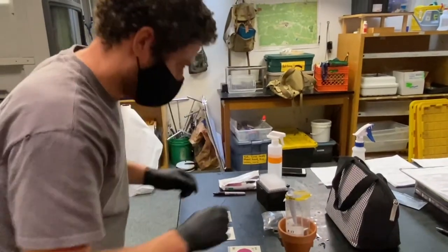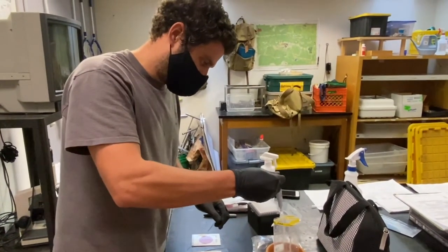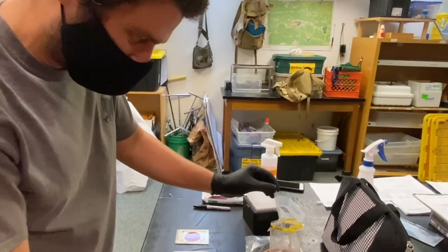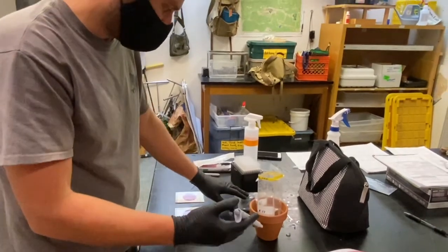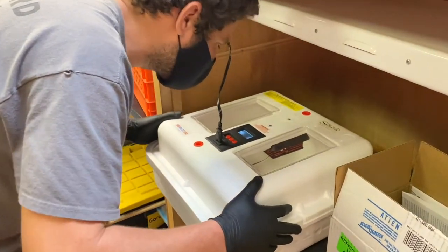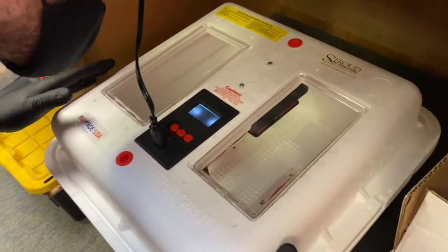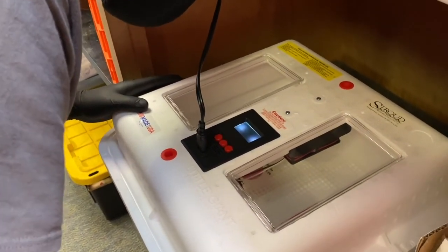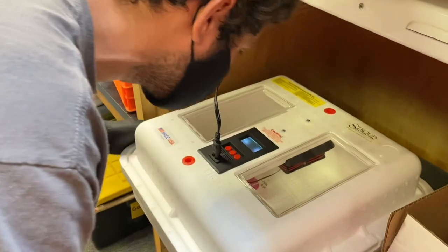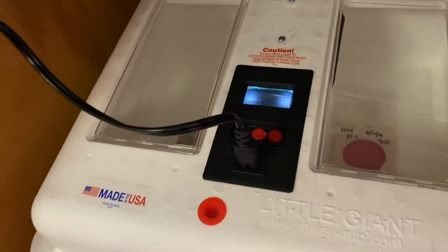We did three samples from the river, and then we're going to switch — with a new fresh tip for the pipette — and the fourth one is a blank, which is our control, using pure distilled water. Now we're putting them in the incubator at 95 degrees Fahrenheit. We have a thermometer in there to make sure the incubator is reading correctly — I just opened the lid so it dropped a little, but it should be back up to 95 in no time. And then we'll put our E. coli samples to rest for a 24-hour period and see what we find.